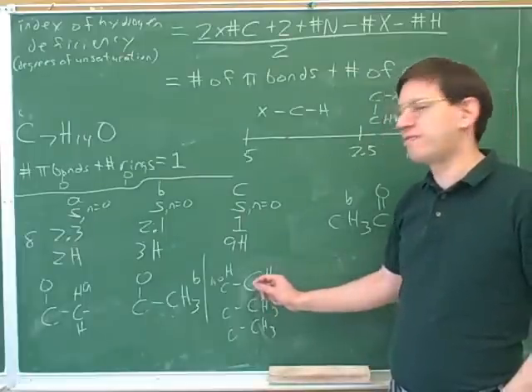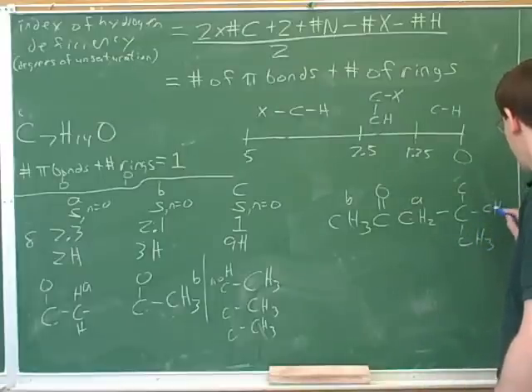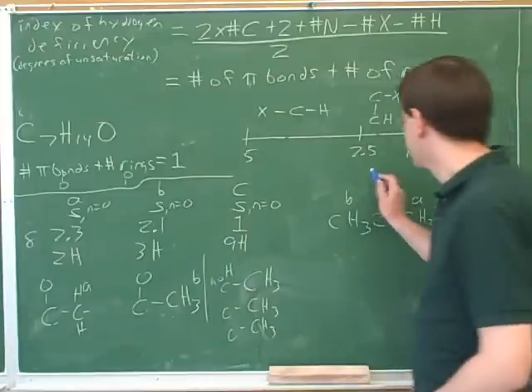Well, I think we can already start to see where those methyl groups are now because we've already worked out this part of the structure over here. Well, we've got these 3 places over here that are in need of hydrogens. And now I think we've accounted for the whole structure. So again, we put the jigsaw puzzle together. You got it.